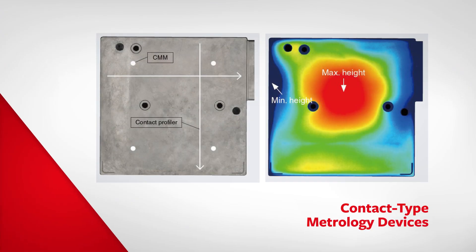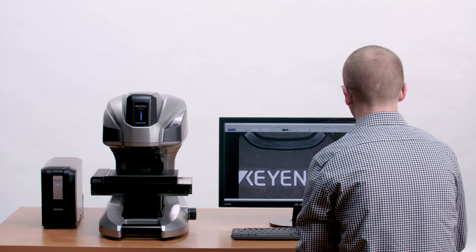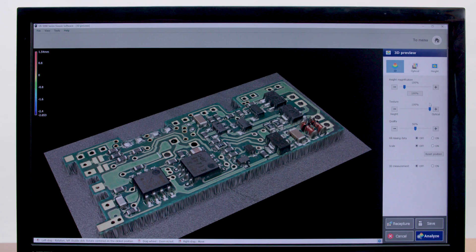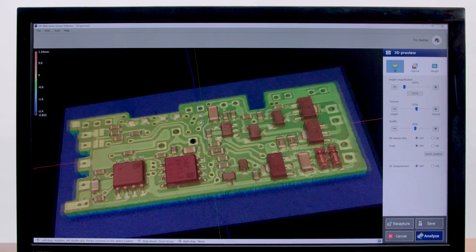Traditional contact type metrology devices, such as profilers or CMMs, are limited to acquiring point or line data. By employing a structured light pattern, the VR can automatically measure a part with just the click of a button. A dense data set is gathered, allowing the user to understand their parts in greater detail.